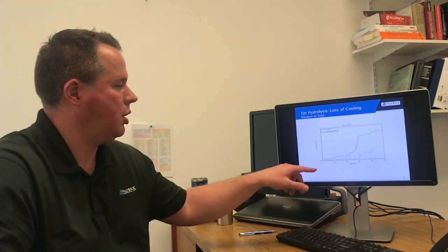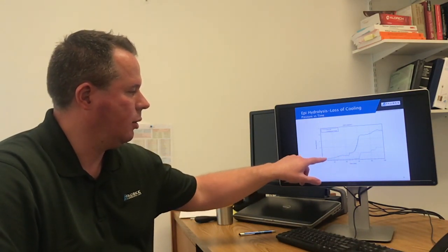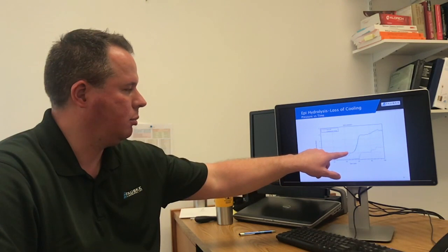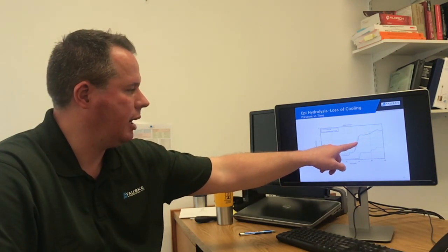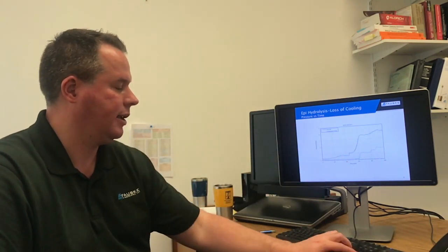So here's a look at the pressure. So this is, again, we were heating up the water and nitric. Once we got the process temperature, before we started adding the epi, we added the nitrogen pressure up to 1 bar so we wouldn't have a vacuum in the test cell. And then you can see the pressure rise as the temperature rises inside the test cell.